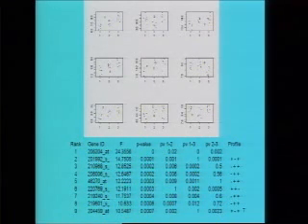For the rank 1 gene, what we notice is the p value corresponding to the F test is 0. So this gene has a distinct behavior in all the 3 groups. It doesn't have the same profile in the 3 groups. That is the conclusion from the p value of the F test. Now if we look at the p values of these pairwise tests, these are 0.02, 0 and 0.002. So these p values and the strip chart tell us that this is a gene which has a distinct behavior in all the 3 groups. So mu1 is not the same as mu2, mu1 is not the same as mu3, mu2 is not the same as mu3. It has a distinct profile in all the 3 groups.